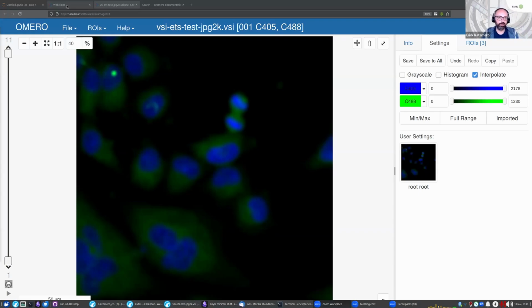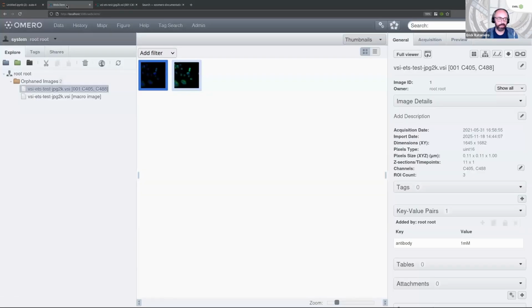There is a lot of institutions that are really mindful of security that use OMERO, right? I'm not a security expert myself, but there are lots of pharma companies that use OMERO, lots of universities use OMERO, and I don't think we've ever had at Jax in my previous job, IT say anything like, oh, we found a vulnerability in OMERO.